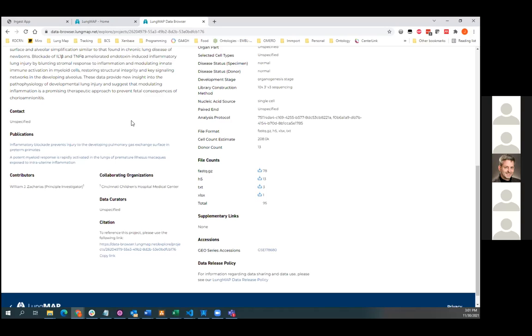I imagine all of us have gotten to the point where we've gotten near the end of a project and we've needed to submit data, and we're struggling to go back through notebooks and files, and is the file on this computer or on that computer or on a server or on my laptop, or which flash drive was it on, and it's hard to find the information.